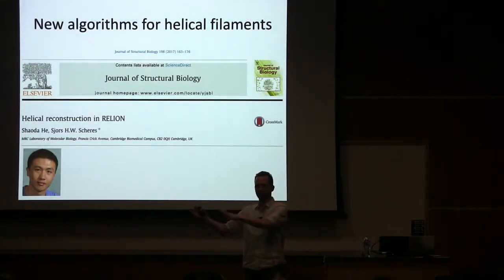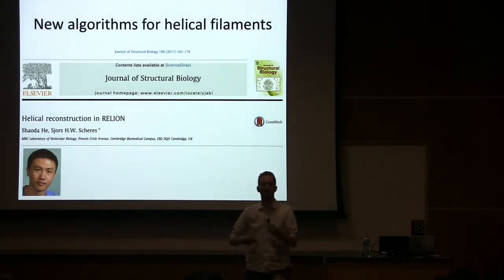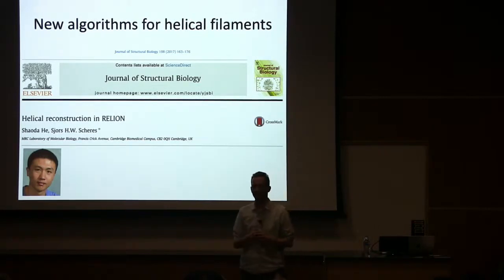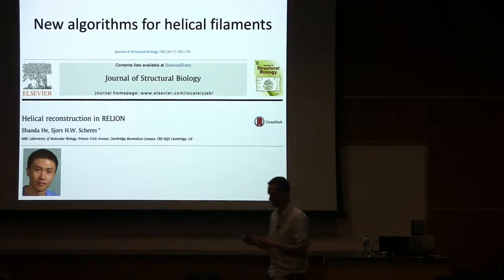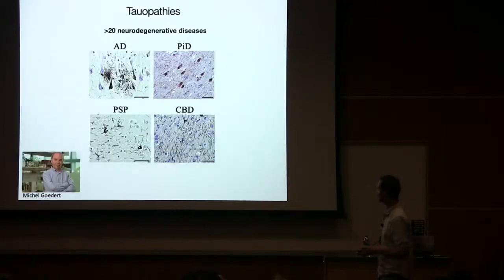This work was made possible first through image processing developments, and that's why we're keen to have both an experimental side and an image processing side of the lab, because they're highly synergistic. You develop methods that make new experiments possible, and your experiments inform on what new methods you need, and we like that cycle to go on with all our colleagues at the LMB, but also specifically in our own group. Shaoda, a talented PhD student in the lab, implemented helical reconstruction algorithms inside RELION, which made it possible for us to look at these helical filaments.